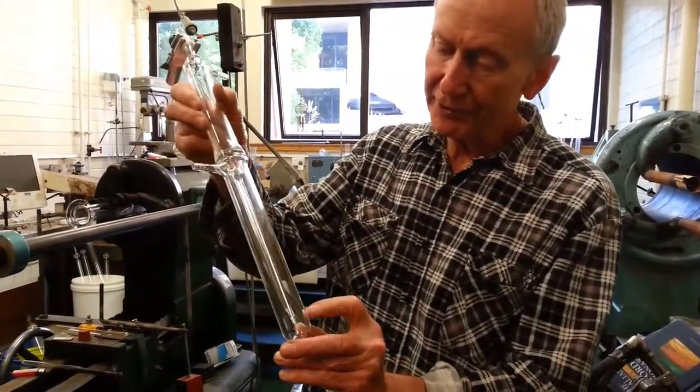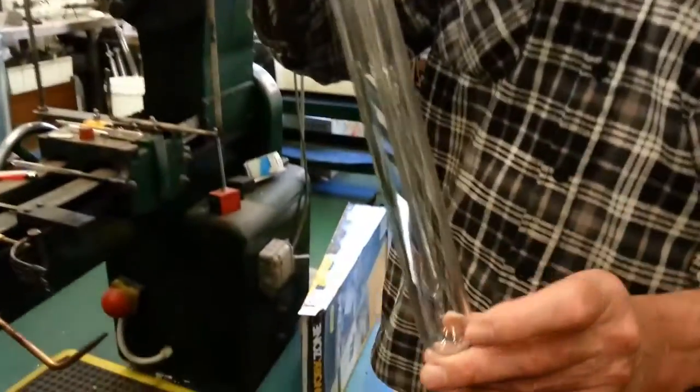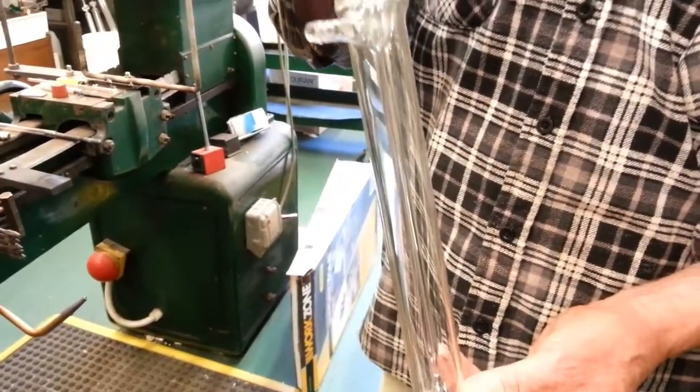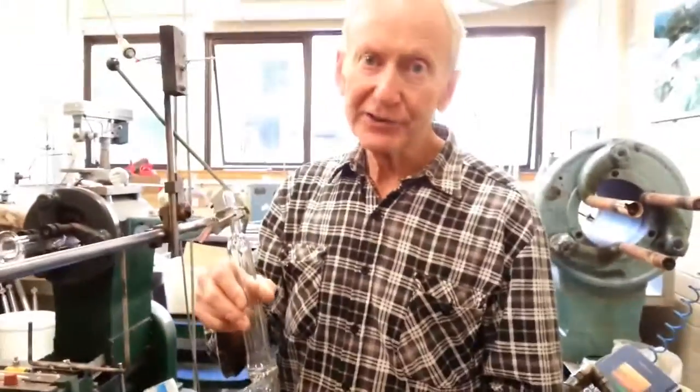Also, I put a very fine capillary down here, because one of the problems with oil bubblers is you can easily get sucked back when you get a negative pressure. With mercury you don't.